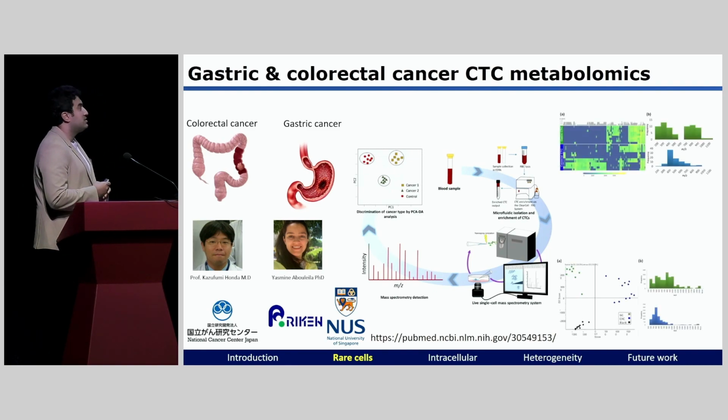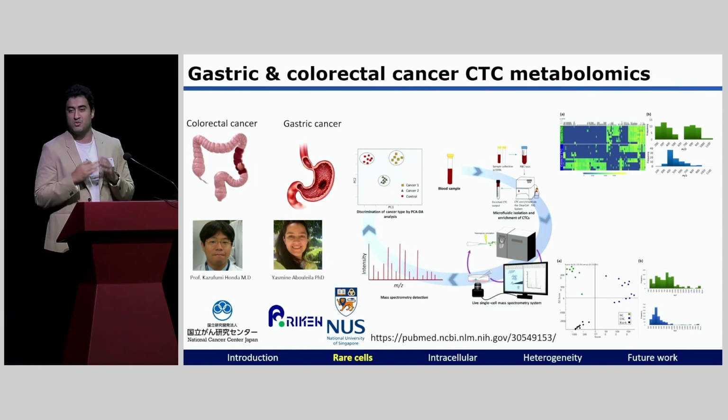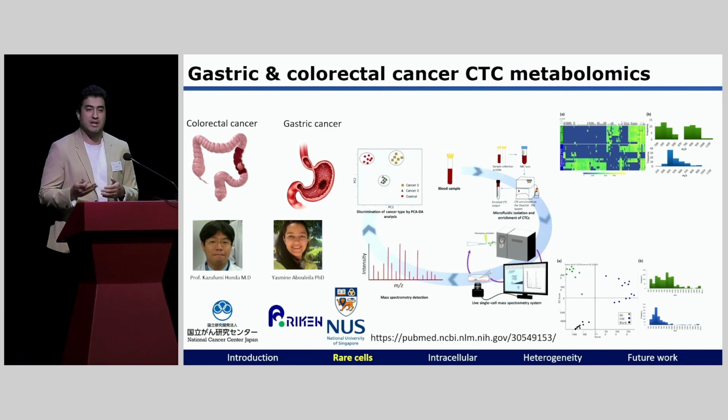And we could successfully, at least, see some differences, right? Now, I have to be very careful with my claims here, because we only use m/z. Of course, we look at the isotopic pattern, etc. But at least it showed promise, right? We can see some features that are there with a very high significance, even after p-value correction, etc.